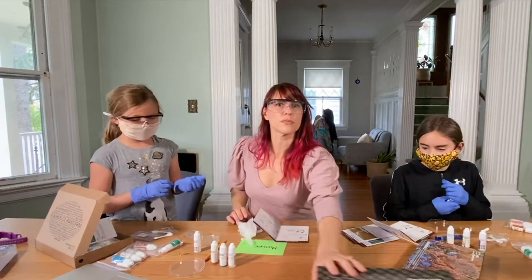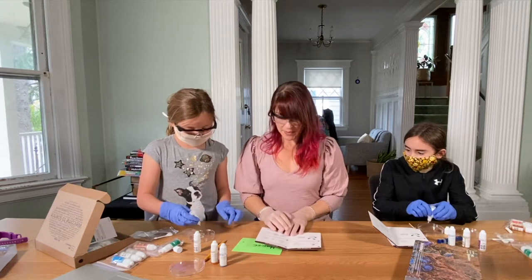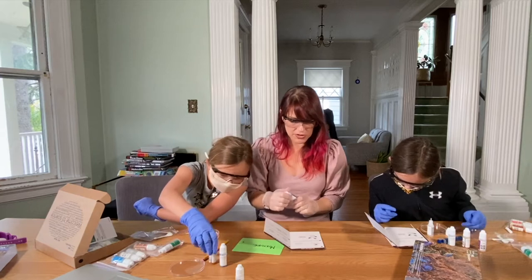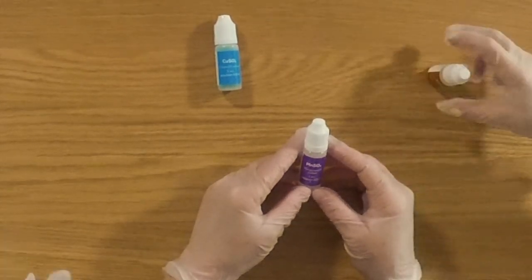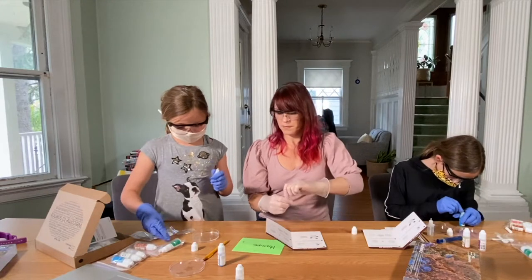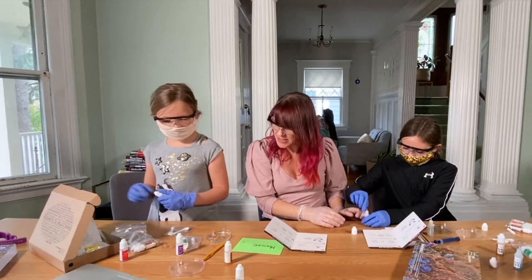That looks like copper sulfate. Pour the liquid glass into the Petri dish. All of it? I think so. Wait, this is liquid glass? It claims to be. Now apply the solutions of metal compounds — called metal salts — to the surface of the sodium silicate solution. What we're working with here are manganese sulfate, which is the purple one, iron chloride, and copper sulfate. Four to five drops. It looks cool — it kind of looks like jellyfish. It does look like jellyfish!